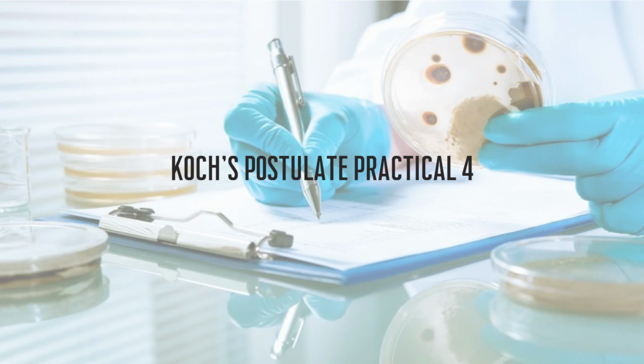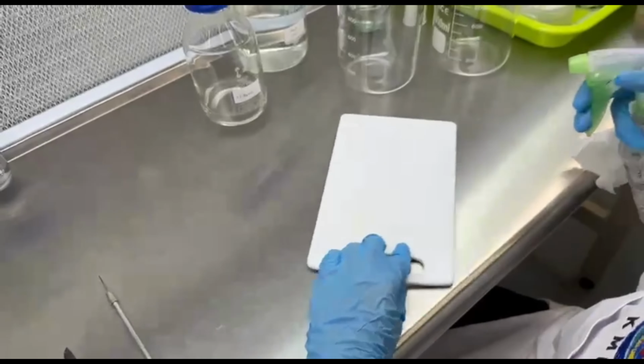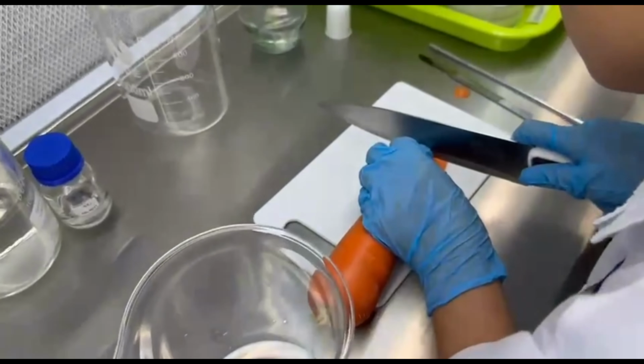Koch Postulate Practical 4. The work area was wiped with 70% ethanol. The carrot was peeled and sliced into discs.